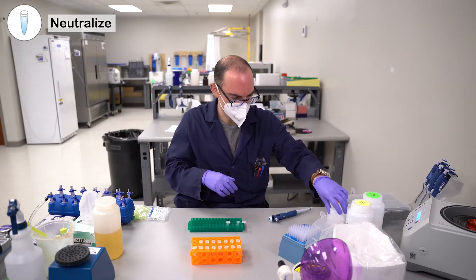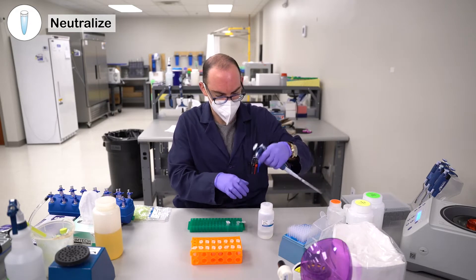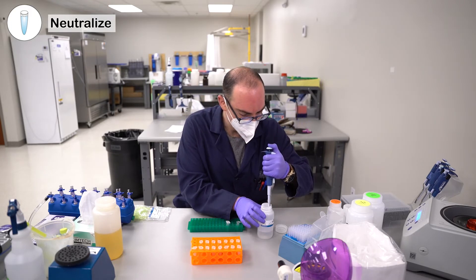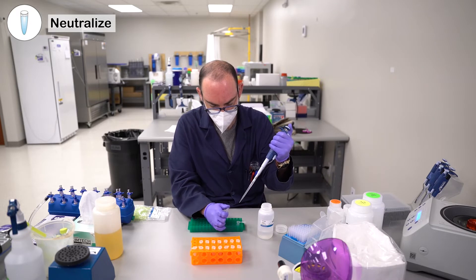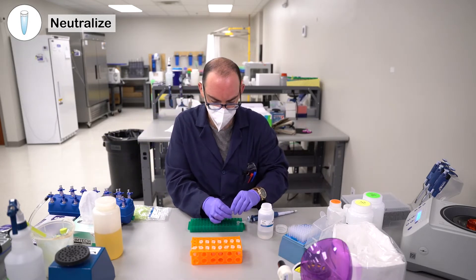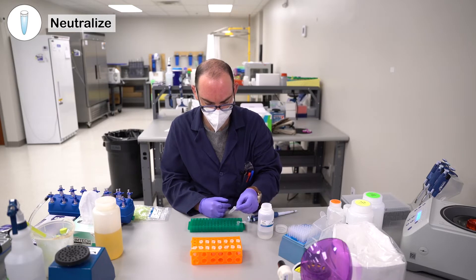Then you're going to add the same amount — 175 microliters of Solution 2. This time you're not going to pipette mix; you're going to add it in and then gently invert the tube 10 times.